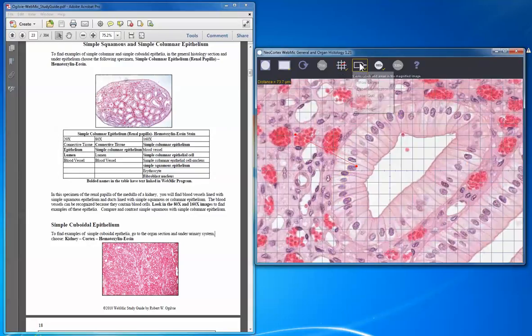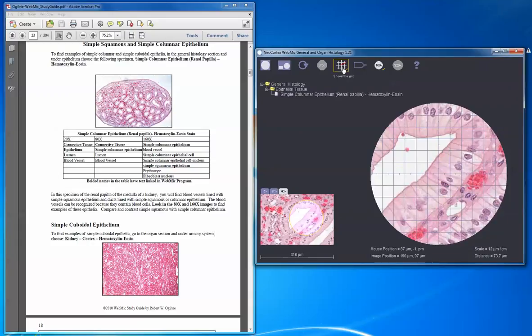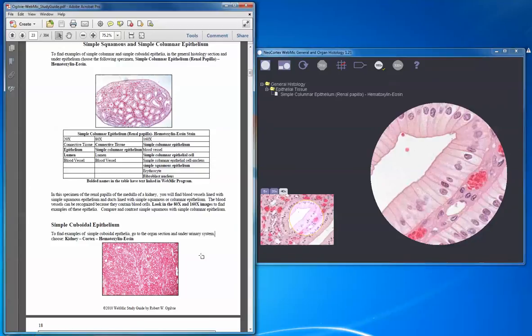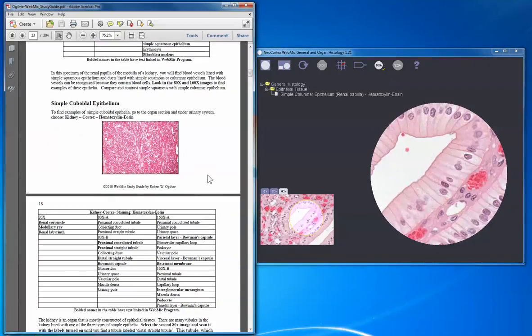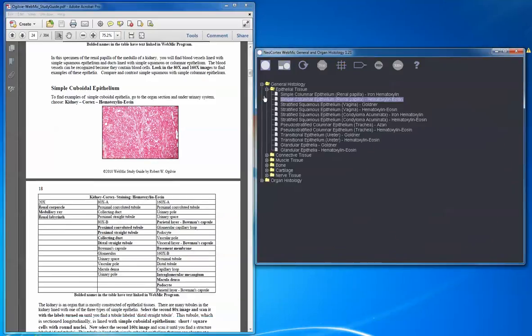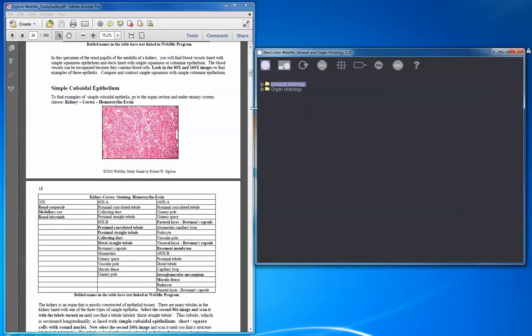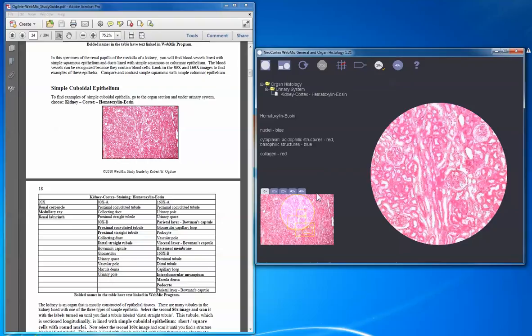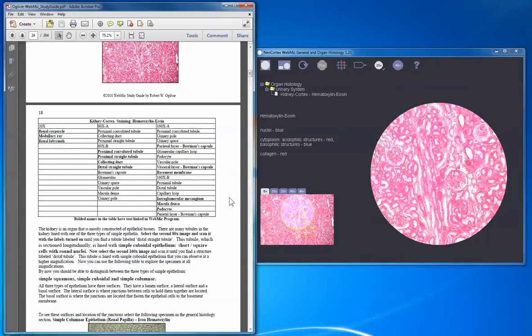I'll go back, turn the labels off, and remove the grid. There's another specimen to look at — we'll jump over to the organs. Go to the urinary system, find a kidney cortex, hematoxylin and eosin specimen, and there it is. You do the same thing, look in the table to see what's there, and your guide to study is the simple text provided.